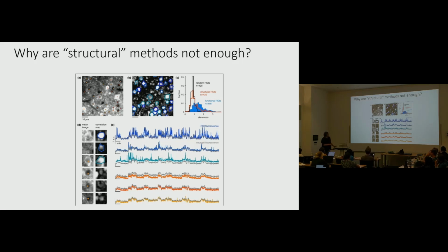And so if you look at some of these ROIs down here that were present in our manual label, because we saw a donut there, we thought, okay, this has got to be a cell. But then there wasn't really anything very clear in the exact same area in the correlation map, so it didn't get picked up. And we plot the traces from that cell and from around it. You can see that the gray trace, the neuropil, is very closely following the colored trace, which is from the cell that we record. These two cases actually look almost the same.